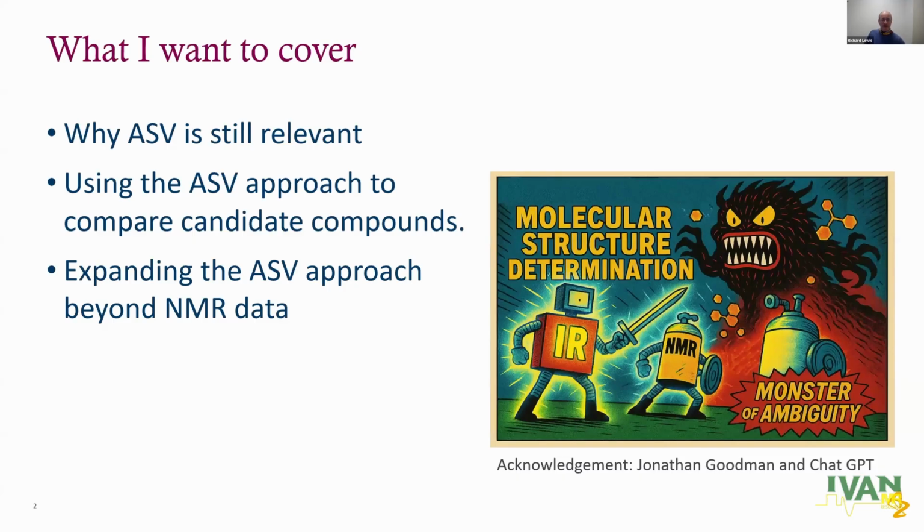So what I want to say is why is ASV still relevant? You probably read in the literature all these AI tools that claim to do amazing things. Why do we still need ASV? I'm going to be talking about using the ASV approach, but not to look at individual compounds, but to compare candidate compounds and why that works better than a traditional ASV approach. And then I'm going to be talking about expanding the ASV approach beyond NMR data.